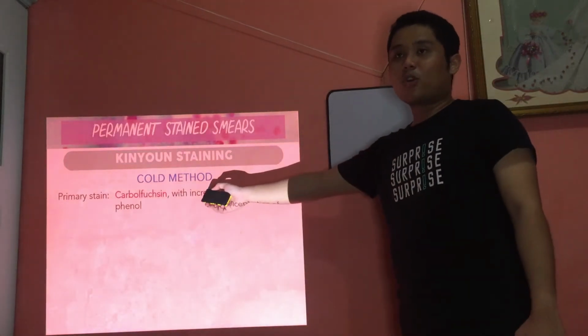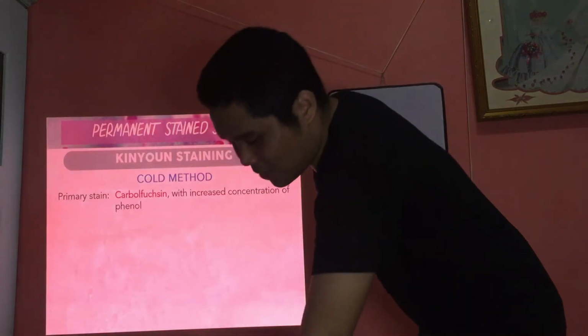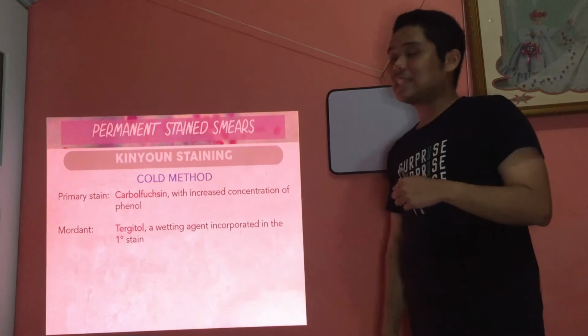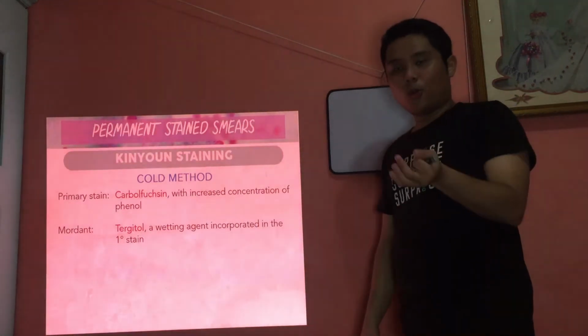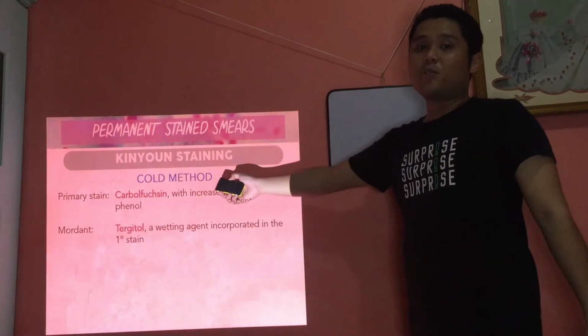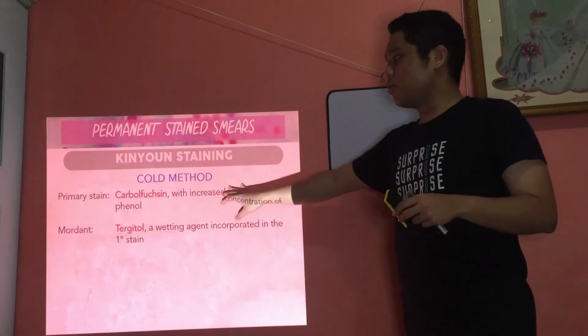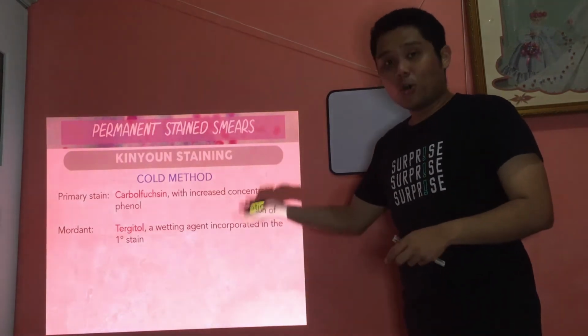But for the primary stain for the cold method, carbolfuchsin, there is an increased concentration of phenol. The difference is for the mordant, because it is a cold method, so it doesn't use heat. Instead, it uses tergitol. Tergitol is a wetting agent already incorporated in carbolfuchsin, so you don't need heating. When you add carbolfuchsin, it already has tergitol, which serves as the mordant. That's why it's called the cold method.